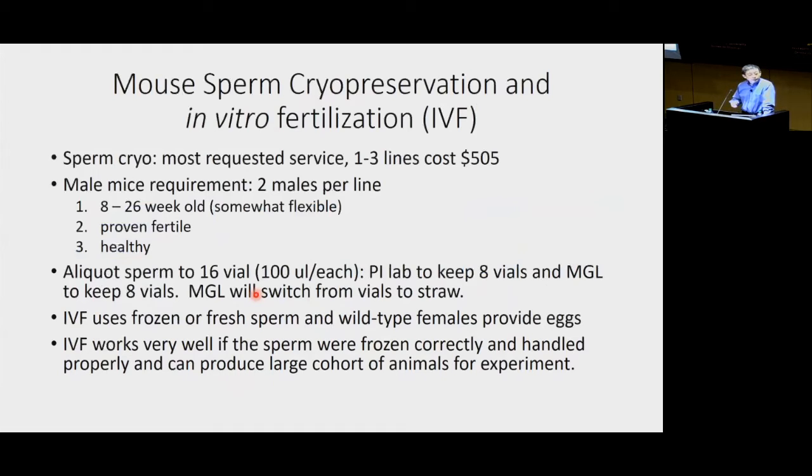If they swim, then I assume they should be okay. Because if I really do IVF to recover them, that's too costly, too expensive, so I don't do that. Just looking to see if they swim, and also looking at the density. That's a qualitative assay, and sometimes it's not objective; it's more subjective.